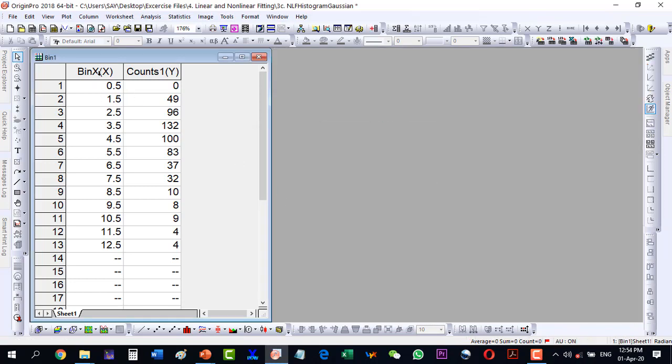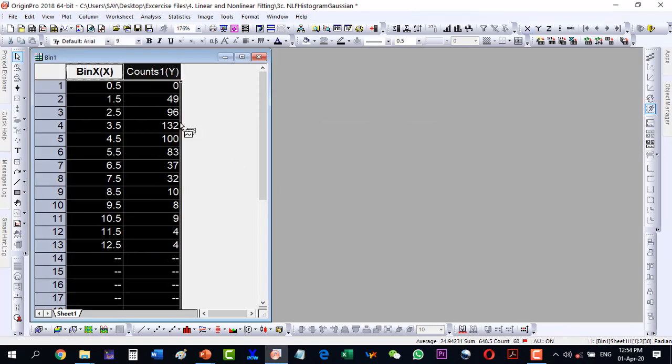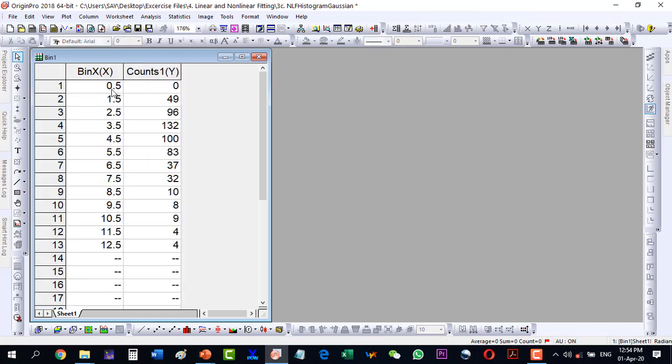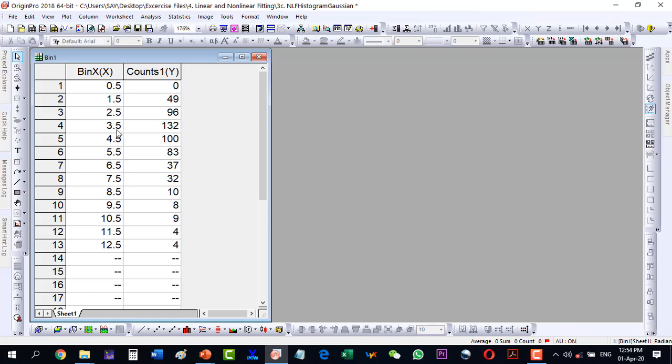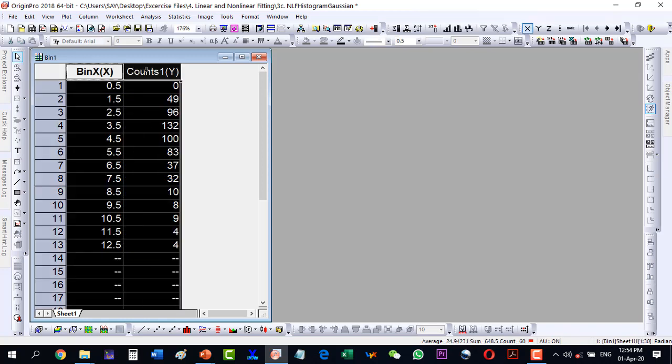Our data points are on the x-axis where we have the diameter of nanoparticles, and on the y-axis we have the count of those nanoparticles. Here we can see that our maximum number is at 3.5 nanometer - those nanoparticles are in abundance. But the Gaussian distribution will give us a perfect idea.